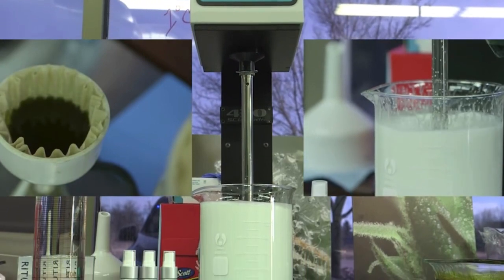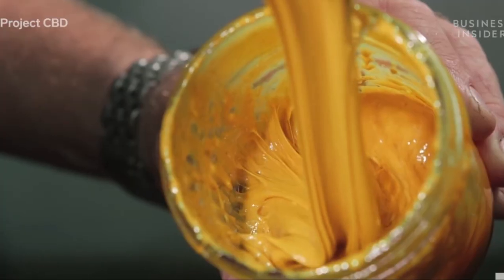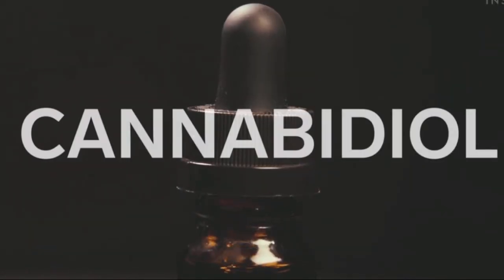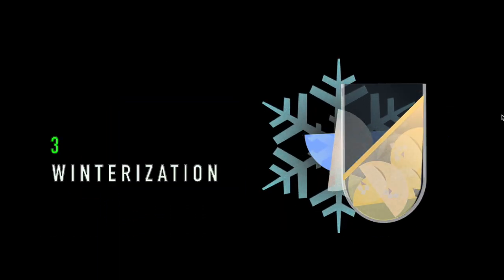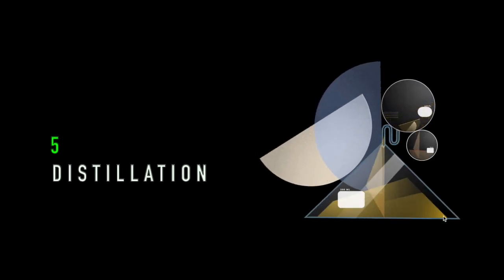We started with 10,000 pounds, and now we have our CBD. Hemp essential oils — just five easy steps. Heat it up, that's decarb. Squeeze it up, extract. Chill it down, winterize and filter. Clean it up — short path distillation, just keep in formation.